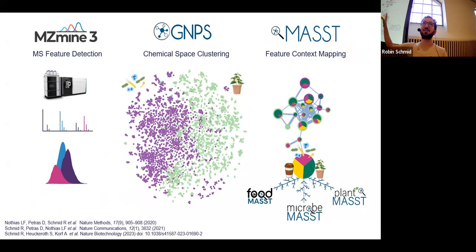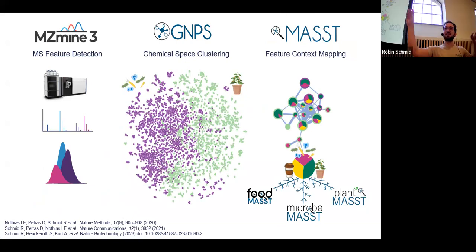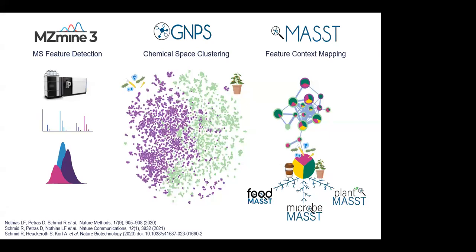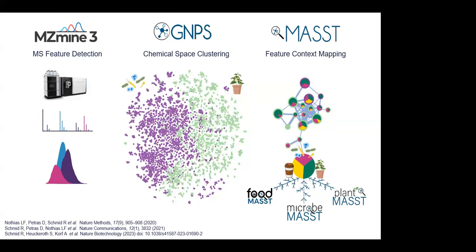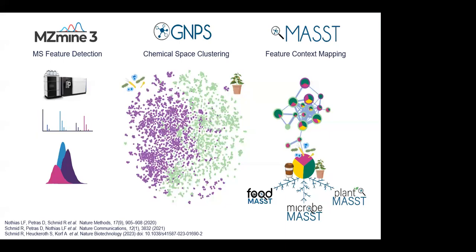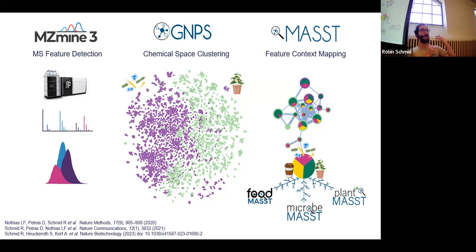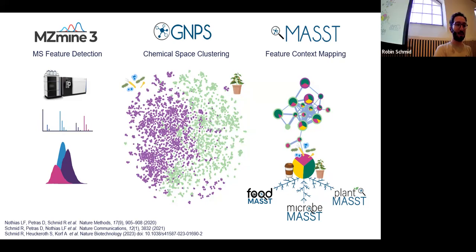And then with GNPS, you can see molecular networking, and we're going to discuss it today a little bit, but then also tomorrow as we look at the fragmentation pattern similarity. So there are fragmentation patterns, we already heard about it. We apply energy to structures, we cleave them down, we measure the fragmentation spectra and look at the similarity to map the chemical space. So what does that mean? If the fragmentation spectra are similar, we hope that the structures of those molecules are also similar. And very often it's the case, and we're going to show some examples of that.